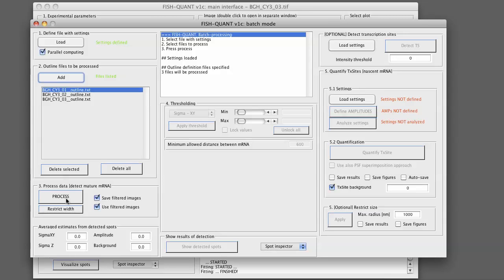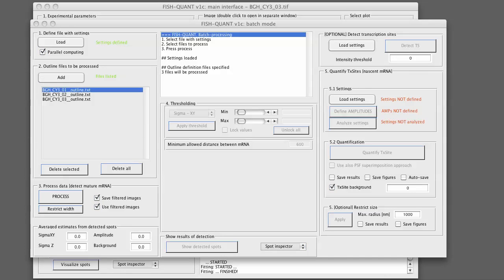You can also follow the progress of this processing in the main MATLAB window. Now you will see a status update in the command window that will tell you where FishQuant stands. So we will process now and come back in a minute.